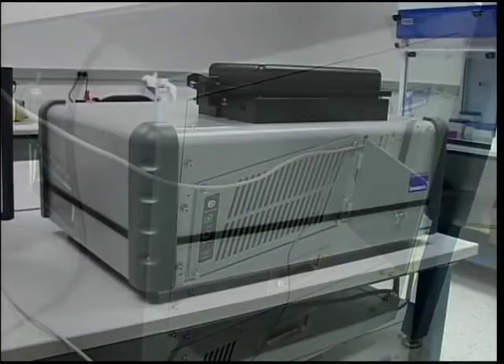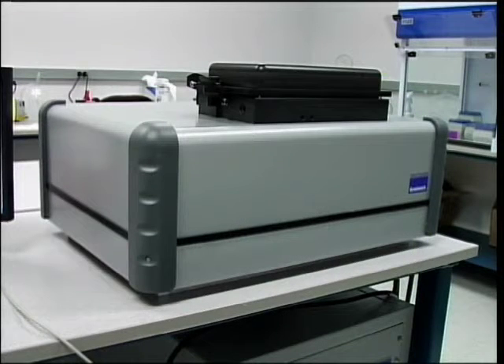GeneBench FX100 is designed for field and lab use, so it has been ruggedized to withstand shock and vibration.